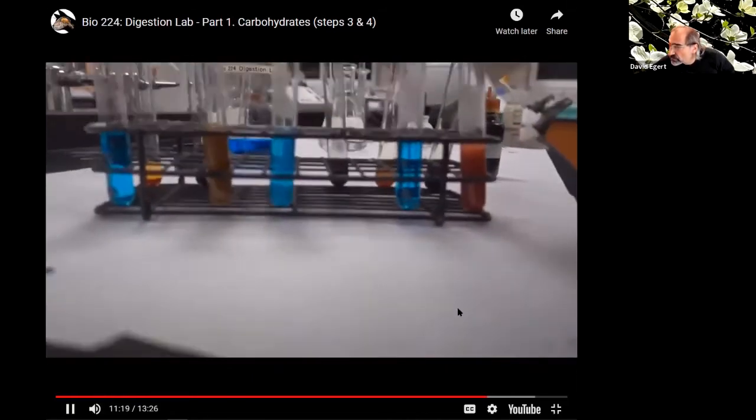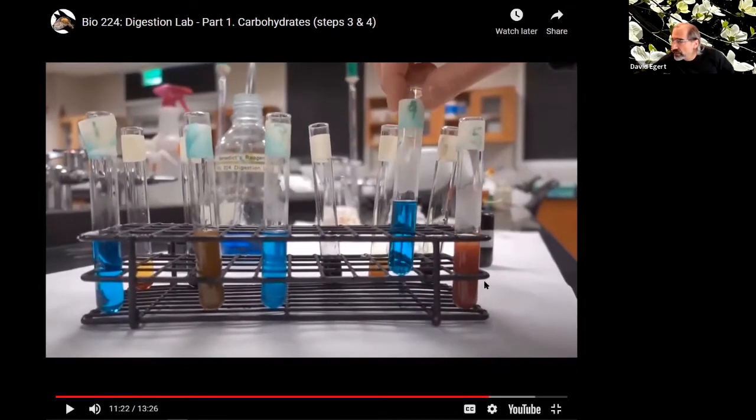So first we can go to our controls again. Here you can see that this is important to see. When it was pure starch, there's no maltose at all. It just stays blue. There's no response, no reaction. The one where it was pure maltose, we got a very strong reaction, this tomato orange color here.